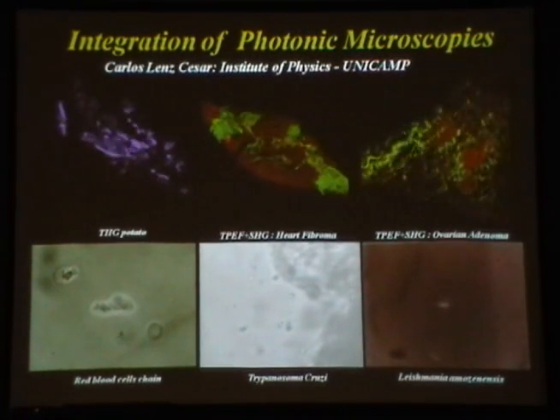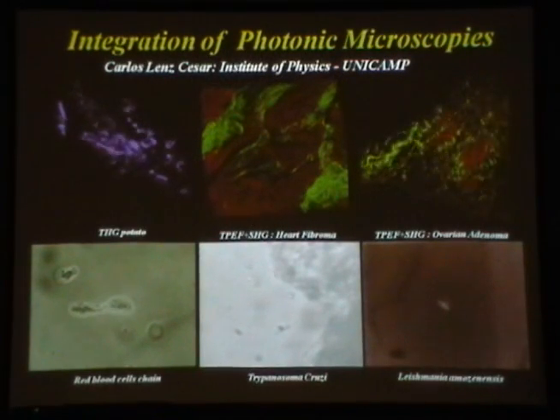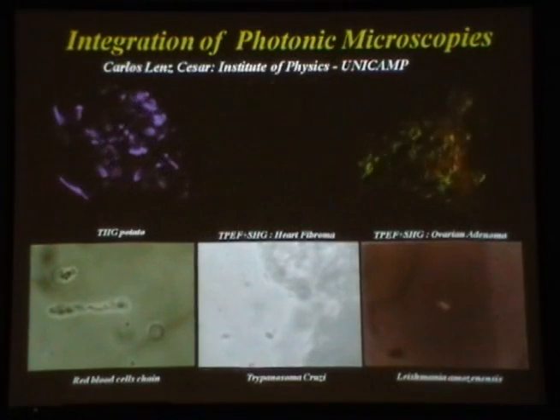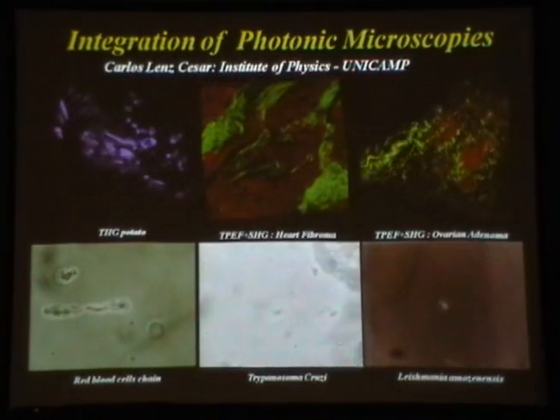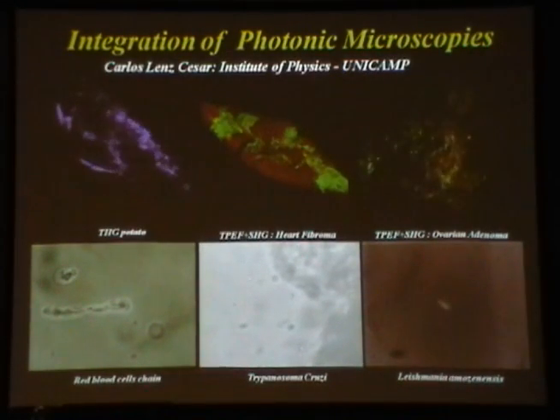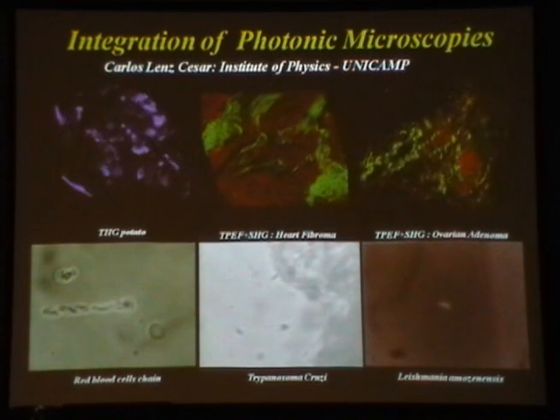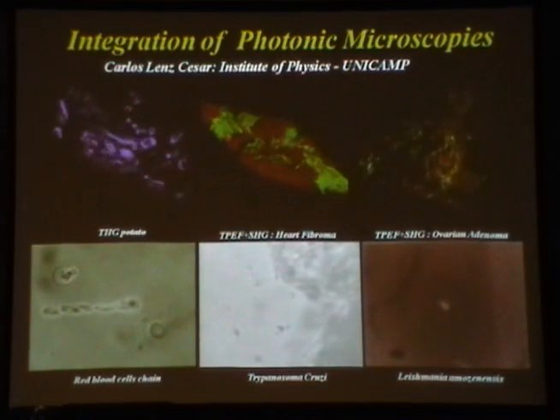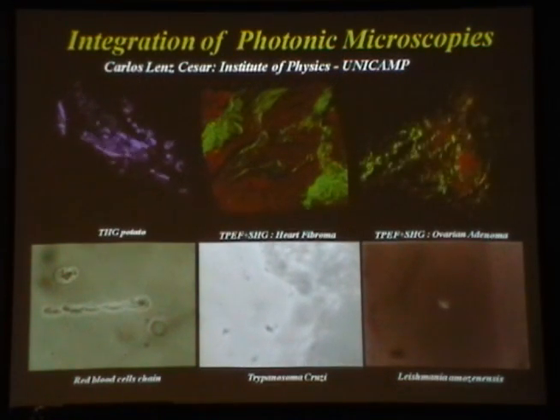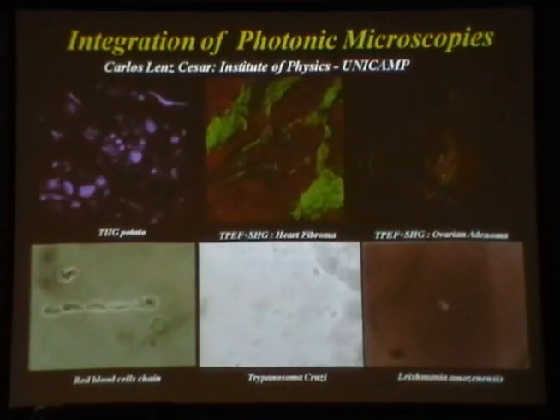It's a pleasure to come here, and I'd like to thank the organizers for inviting me. And I want to talk to you about the ideas of integrating lots of photonic microscopes. And when I say integrate, it means you have to use them in the same instrument at the same time. If you cannot use them at the same time, if you have to use them in different equipment, it's not integration. It's just done in parallel.